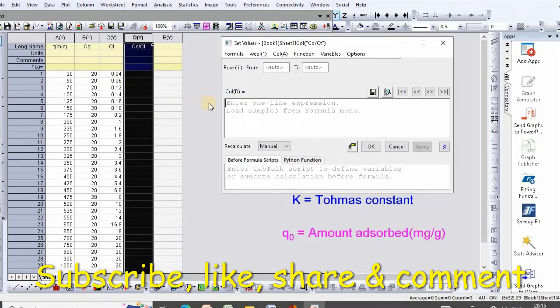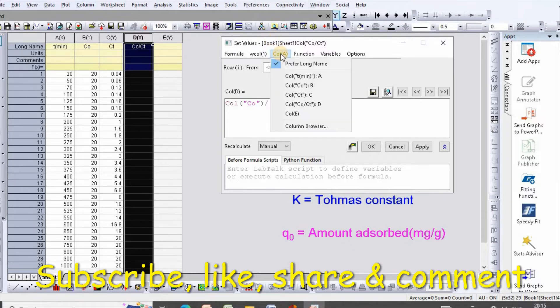Which is add column B, C0/Ct, divided by column C. Then apply.